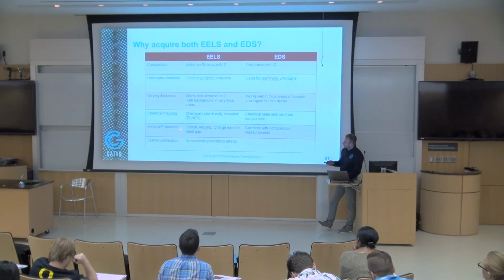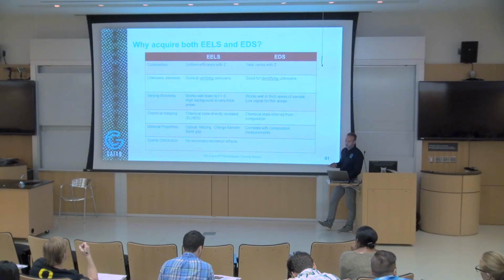In EELS, I showed you some examples. You can get optical information, you can get pretty much everything. You can even work out the band gap using EELS. These are all information that you cannot get using EDS.